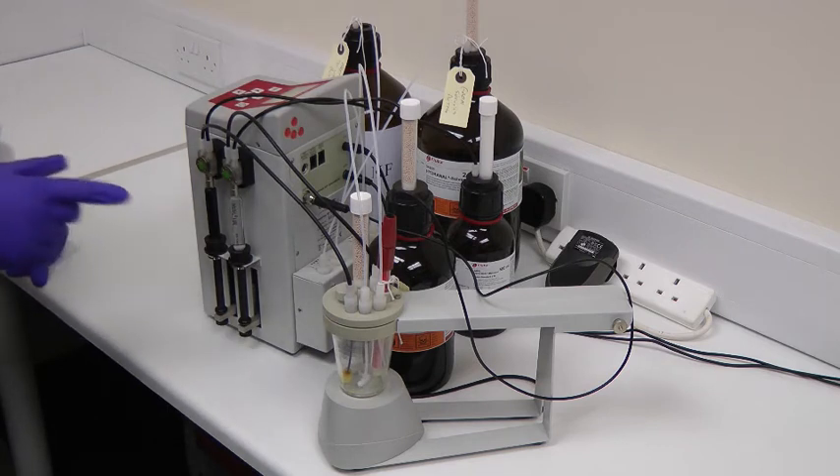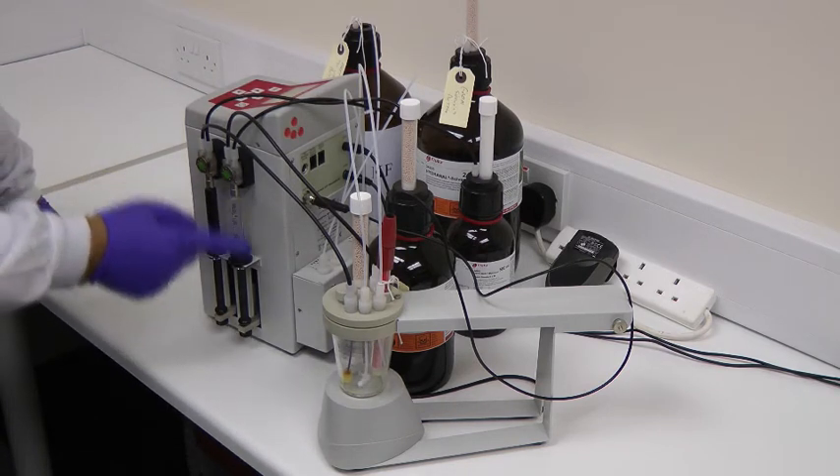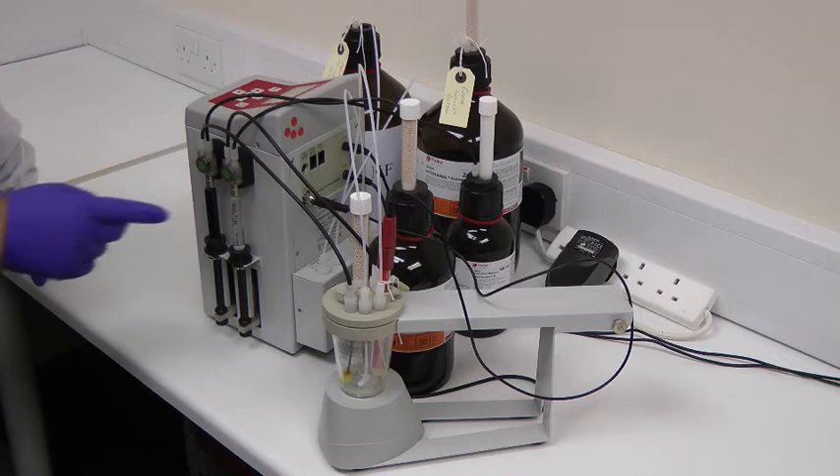The system is delivered with the syringes packaged separately. They should be fitted using the instructions in the manual. One syringe is for the titrant, and the second can be configured either for reagent or standard solutions.